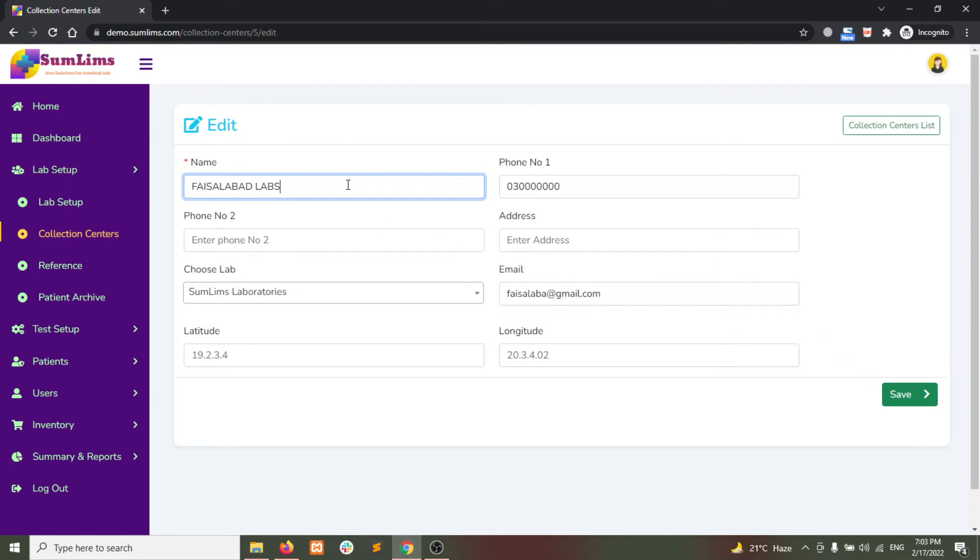You can change or modify any information required and then click on Save.